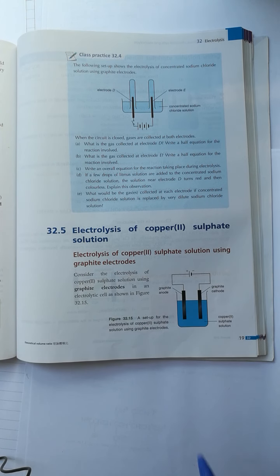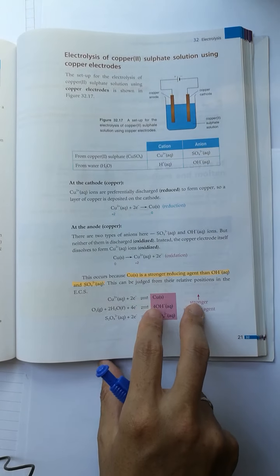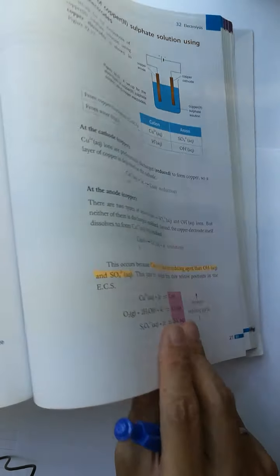You have a solution of copper(II) sulfate inside a beaker, then the graphite electrodes are connected to positive and negative terminals of the power supply and immersed into the copper(II) sulfate solution.